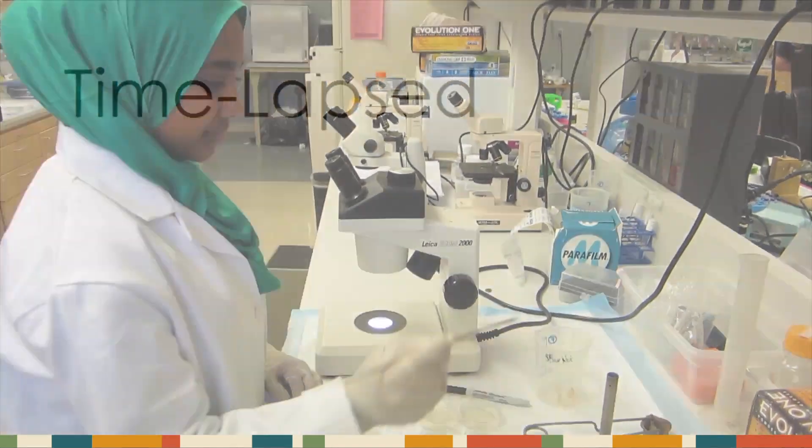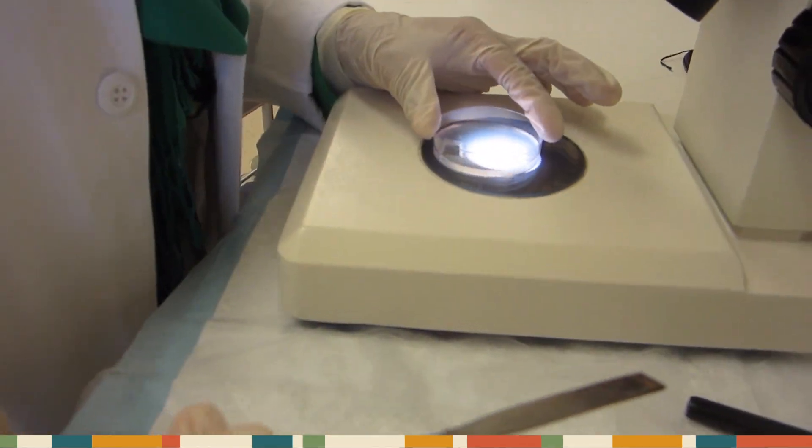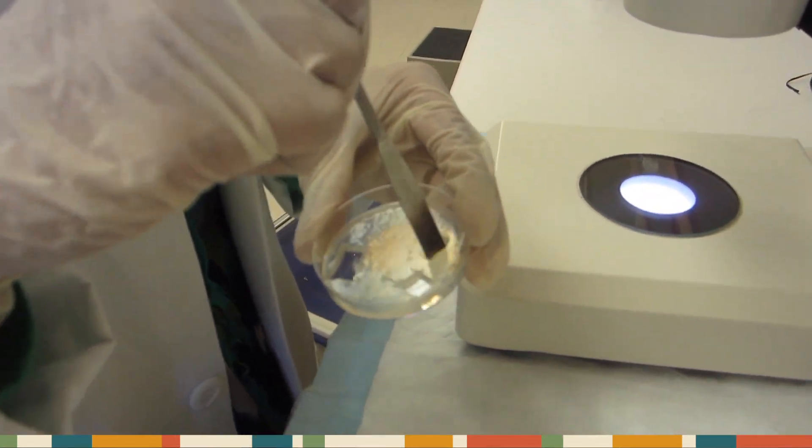Here is a time-lapse version of transferring your two pieces onto your low-salt and high-salt plates.